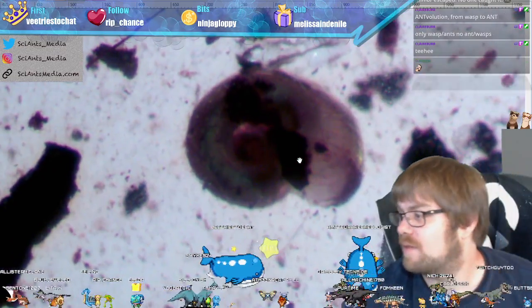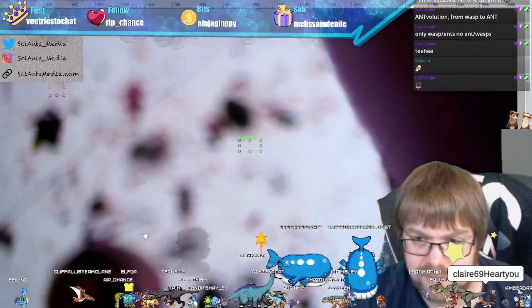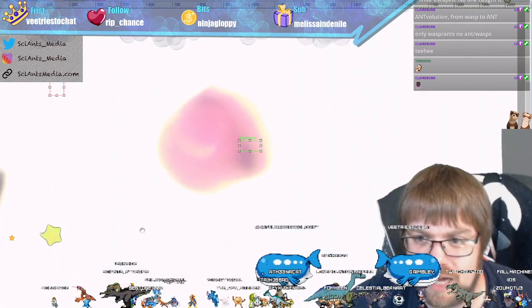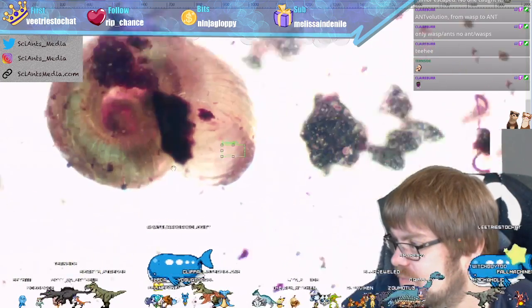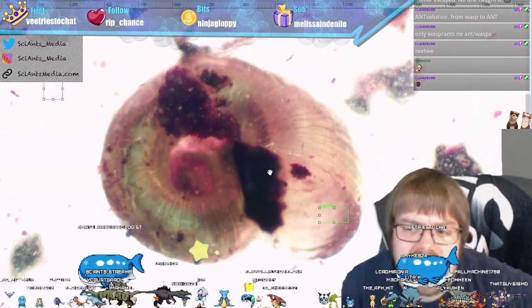Alright. So let's zoom in. This is what I think is the coolest, and you guys will see why in a second. We've nicknamed this sample Gary. It is a snail. With the digital zoom, you can see that the snail is still inside.